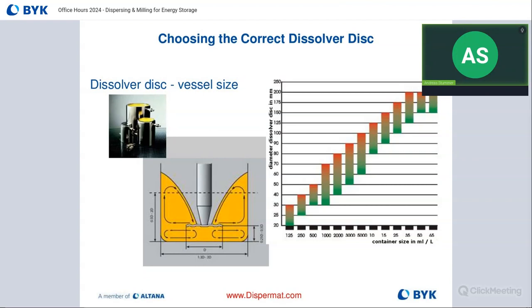Imagine if you have a very thick slurry, almost paste-like. If you use a small blade, that would be very difficult to process the material because the blade would be sitting in the middle of the container, spinning and not doing much, while the product would settle out around the smaller blade. So therefore, it's really important to use the correct blade diameter for your viscosities.